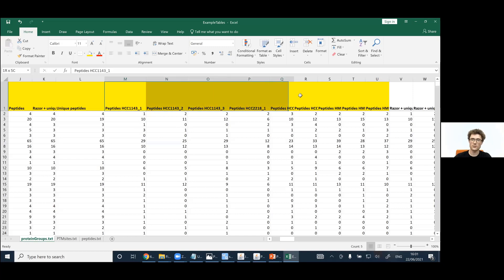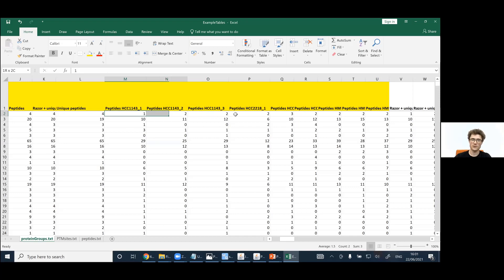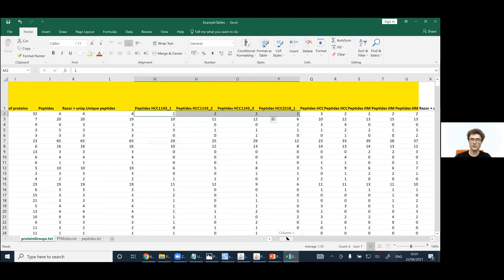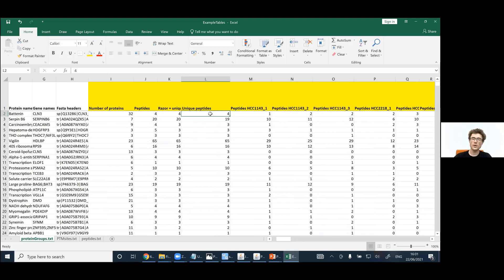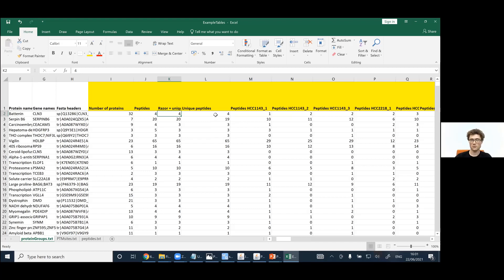This column tells us in which experiment and cell type we found which peptide. There's also information about unique peptides and unique plus razor peptides. Razor peptides are found in multiple proteins within the protein group, while unique peptides are found in only a single protein of the group. So the unique-plus-razor count is always equal to or larger than the unique peptide count.